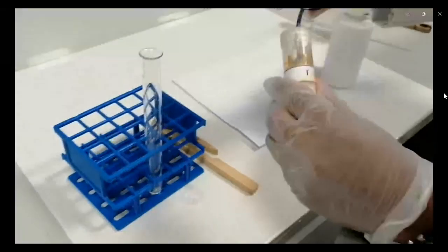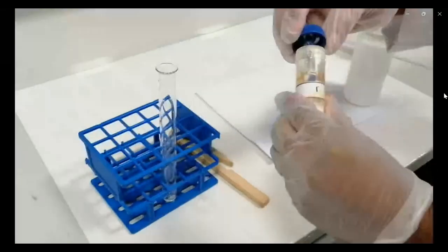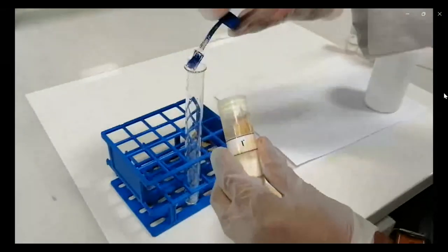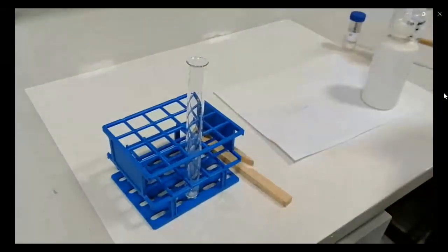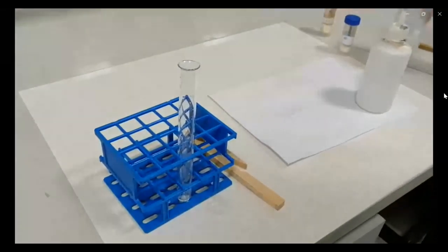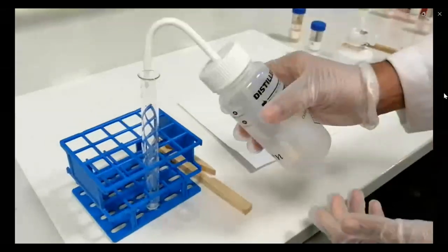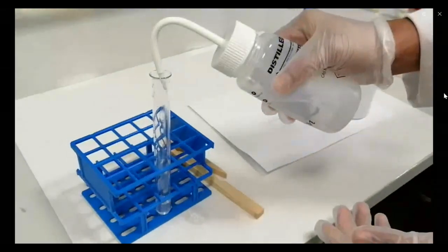Let us do the same test for iodide. You have to prepare a solution first. I would like you to be with me. Don't leave the laptop and go away.